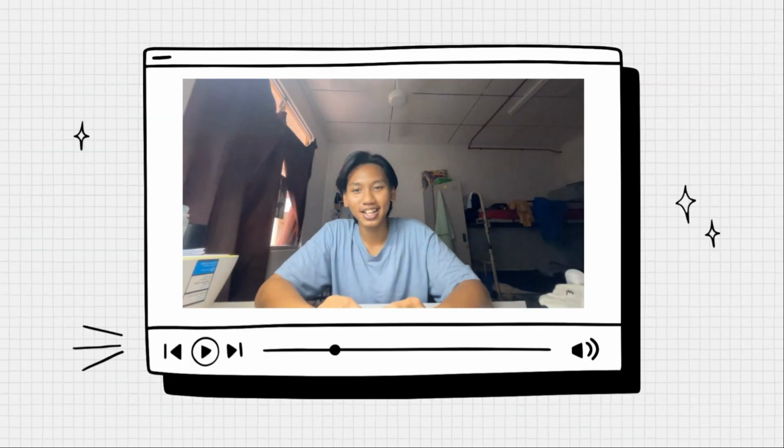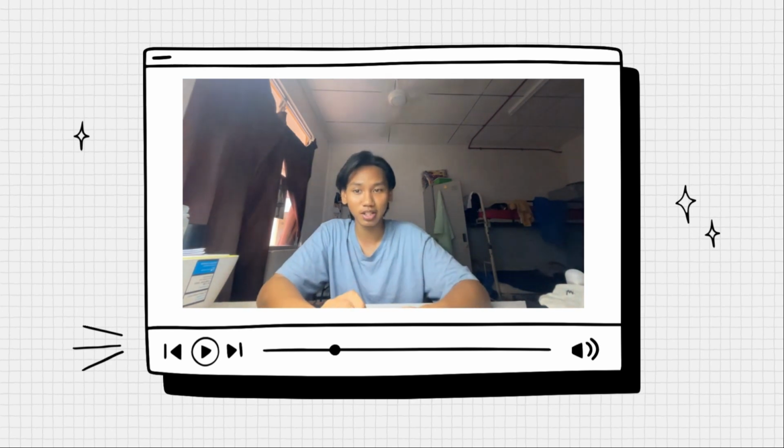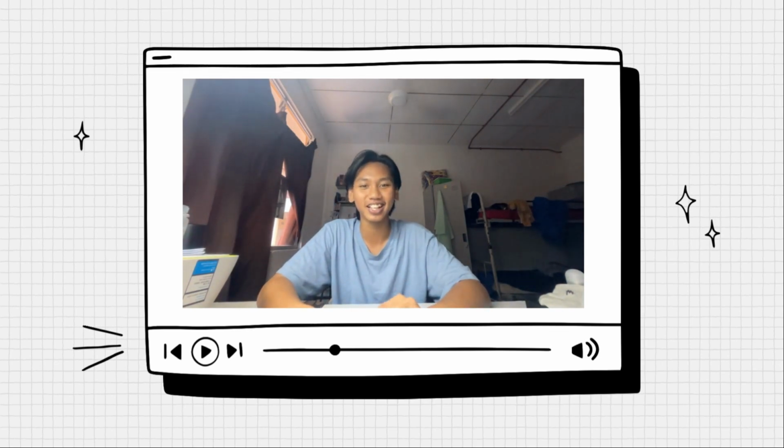So, to summarize, I believe that UV spectroscopy is a fundamental technique with broad applications in scientific research and industry. By understanding how light interacts with molecules, basically we can gain critical insights into chemical compositions and reactions. Whether in a research lab or industrial settings, UV-Vis remains an indispensable tool for scientists and engineers alike.